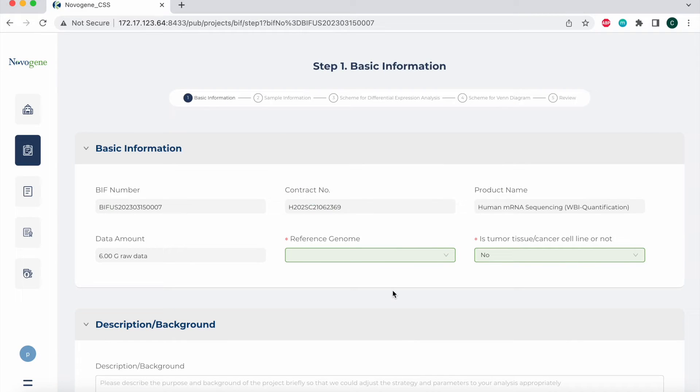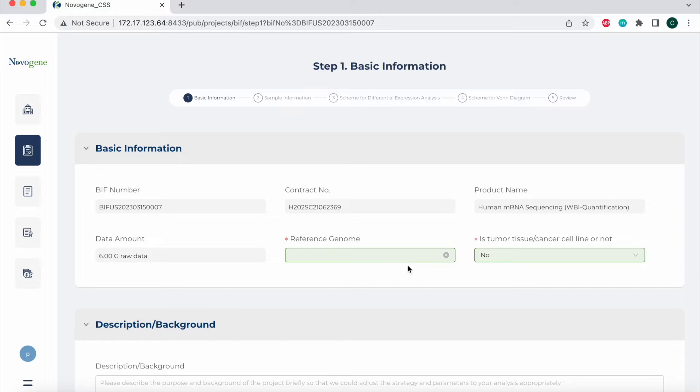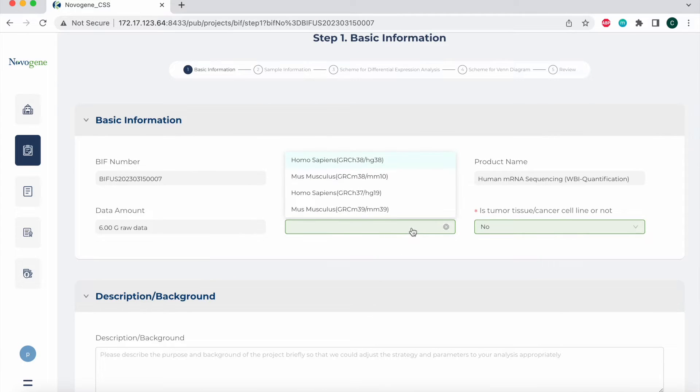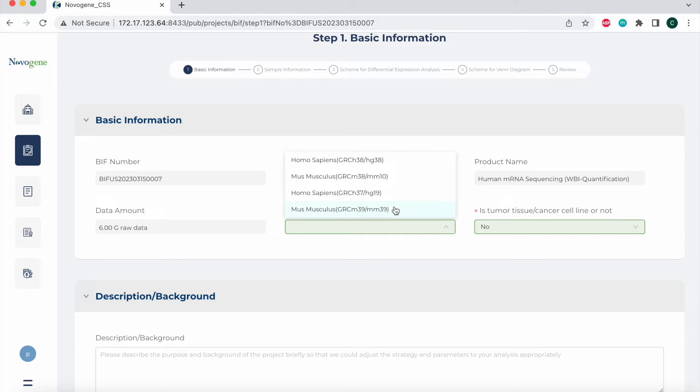If the species type is Homo sapiens or mouse, you simply need to select the reference genome here. Please note that fusion gene analysis is only available for tumor samples or cancer cell lines. Here I selected human or mouse as my reference genome, so I can select one of the four options based on what my product type is. In this example, it is going to be human, so I'm going to select this first one.